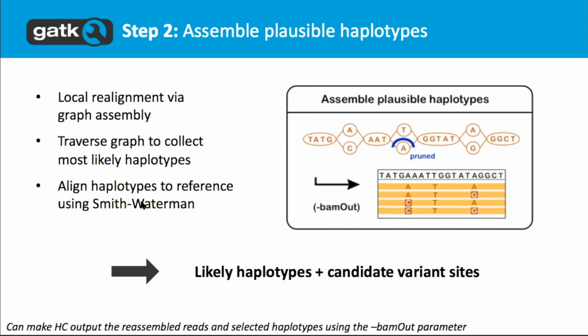Now, it's not entirely true that it's completely disregarding BWA's decision, since it did tell us where the reads belong, roughly what region. And that's what BWA is really good at, and mappers in general are really good at telling you roughly where a read belongs. But they're not so good at giving you a very detailed alignment of the read to the reference.